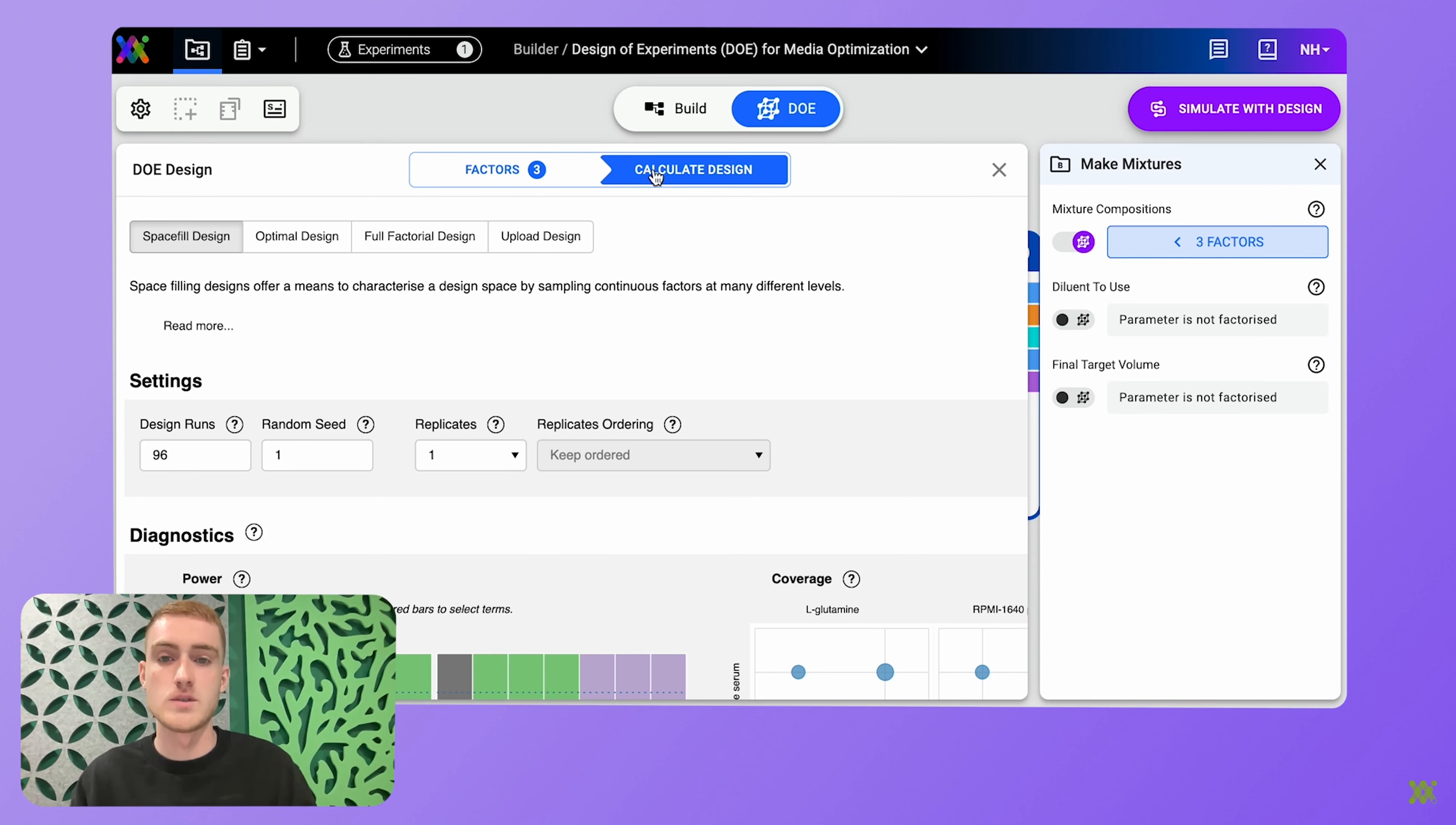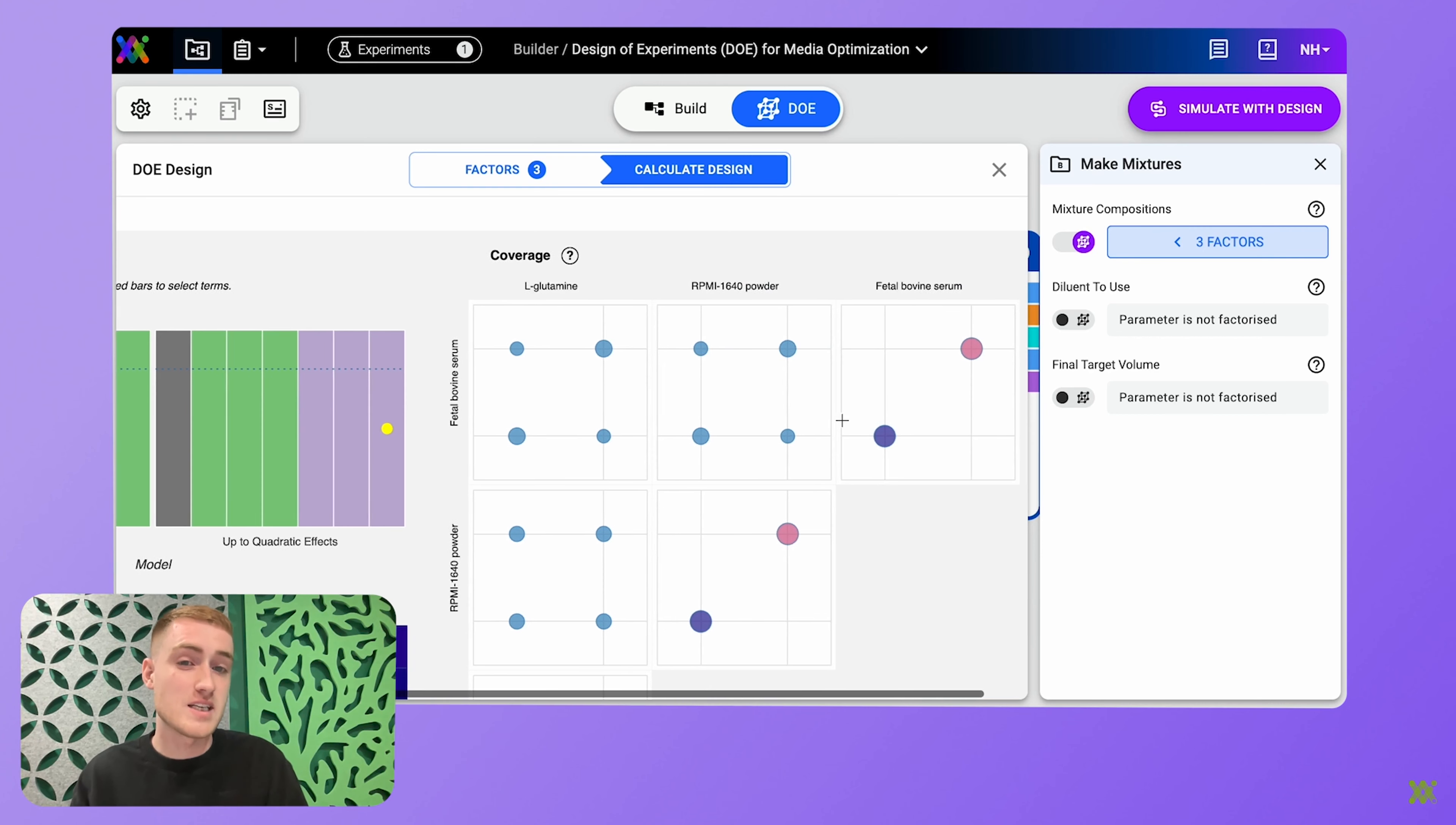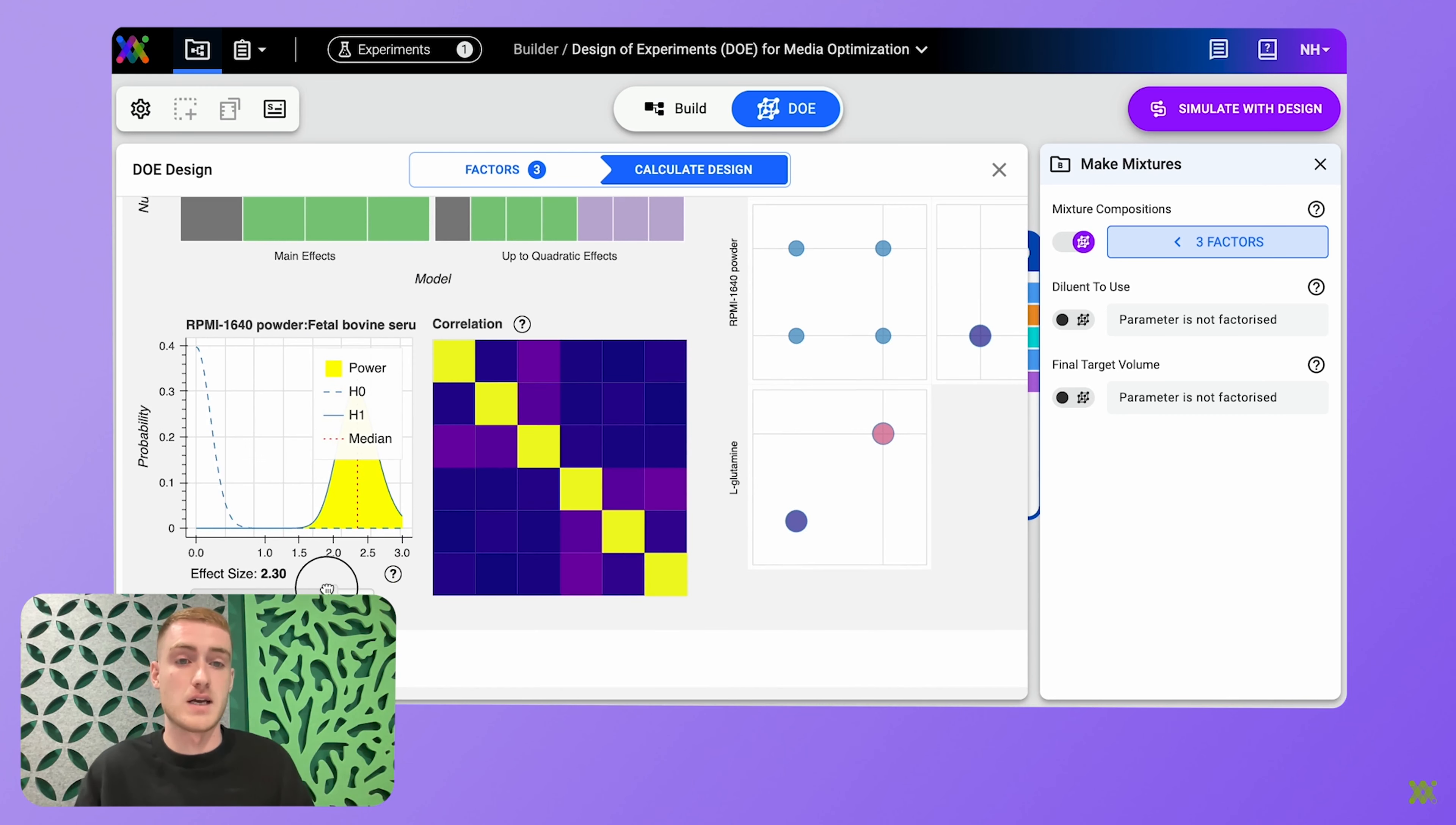So Synthase will then present to you three DOE designs to choose from, and Synthase will generate those designs using the information you've provided. So here I'm choosing a space filling design, and I'm shown the statistical power of my design. And this indicates the probability that the design will collect enough data to confidently identify real active effects.